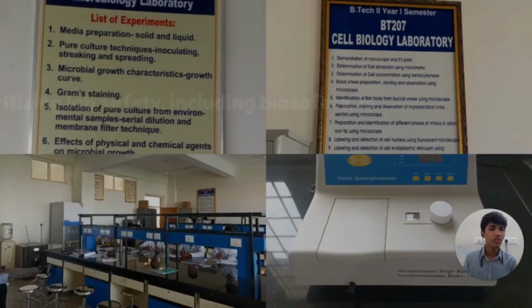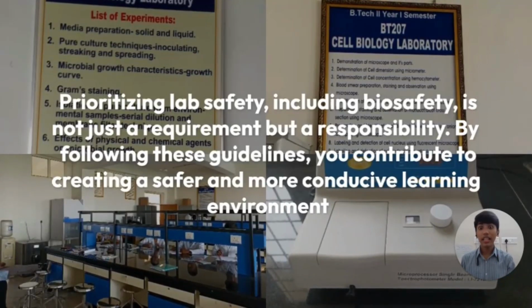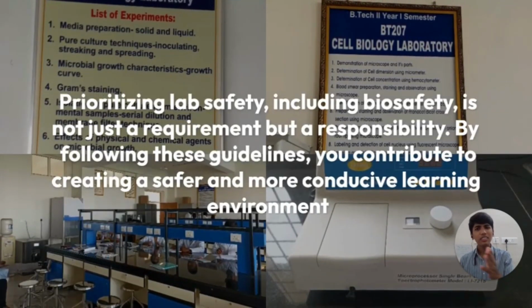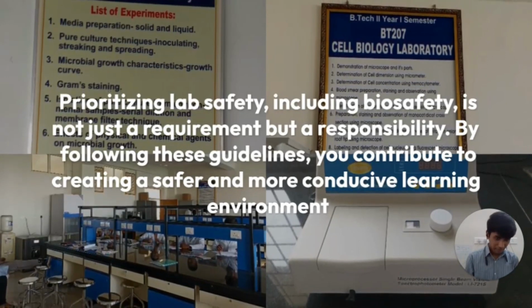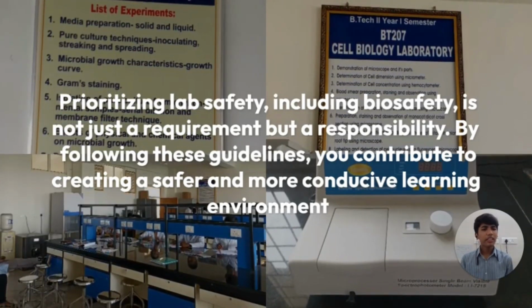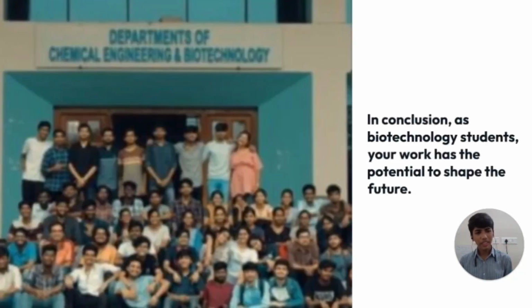Now what is the conclusion of the video? One should always maintain proper safety in a lab since life is very precious. And these are some pictures of the biotech lab in the Department of Biotechnology. While doing any experiment, you should always wear a lab coat and always refer to the SDS.